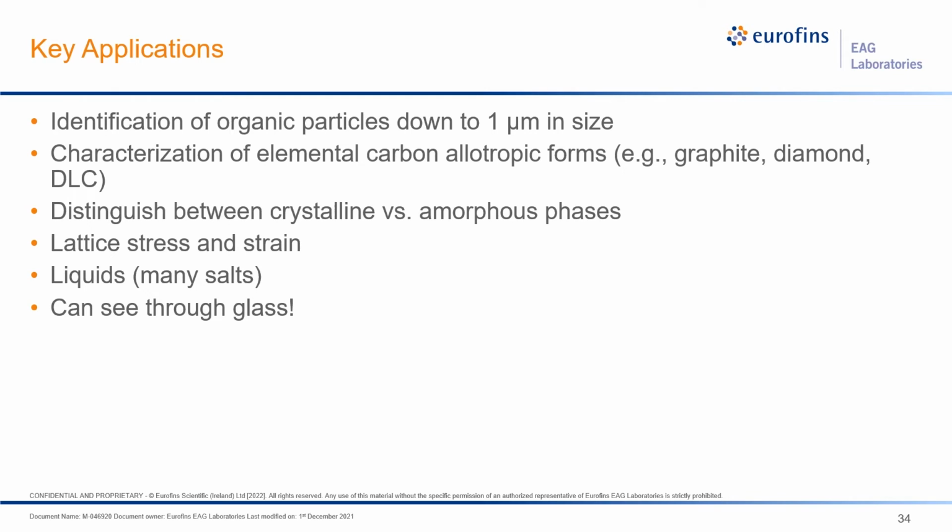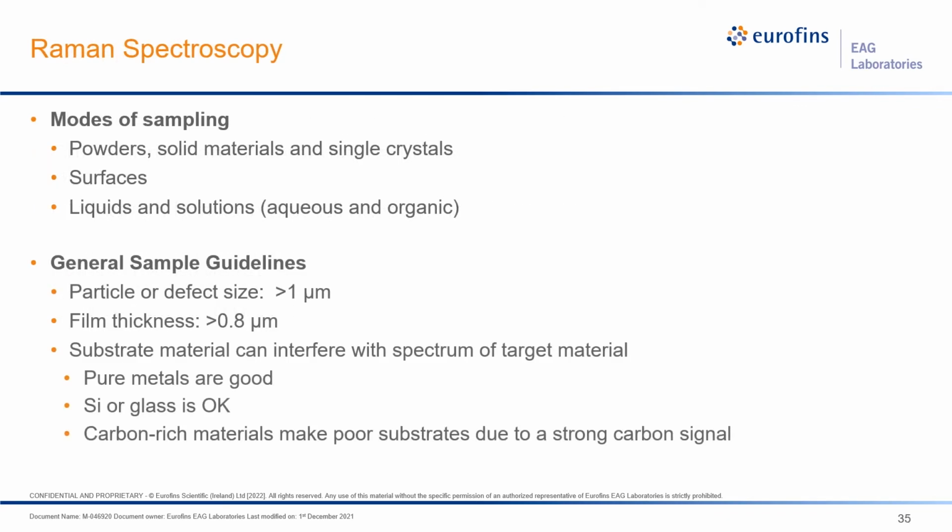And this is really important when, let's say we have a particle we want to analyze that's in a vial, and it's incredibly difficult to fish that particle out. Maybe it's really small, but we can kind of see it. So in this case, it would be really great to use Raman because Raman is not affected by the glass. If we tried infrared on that same sample, we would get no spectra because glass absorbs very strongly infrared. So the glass material would basically take away our chance from getting any kind of spectrum of the actual sample.